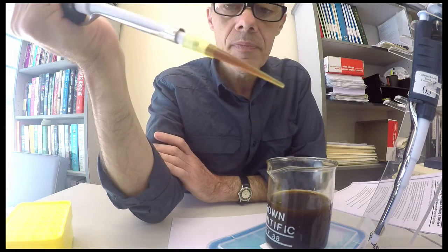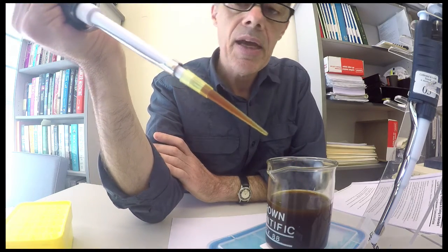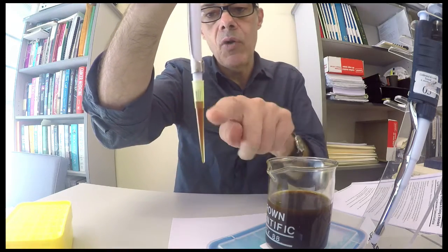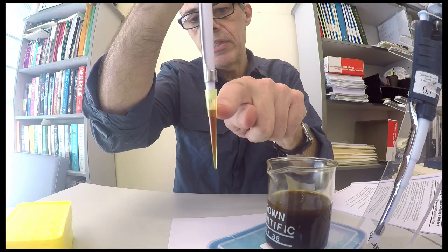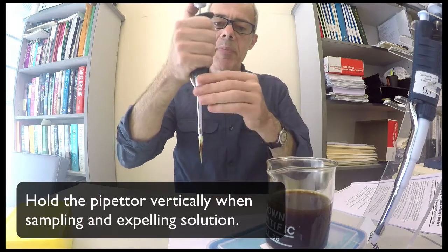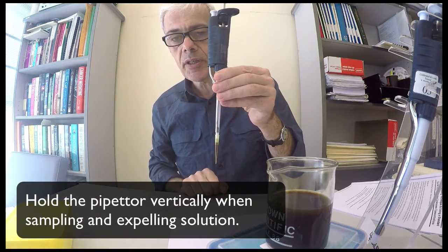And if you look here you'll see quite clearly that we have a volume of 180 microliters in here. Keep the pipette in the vertical orientation when you're doing this.